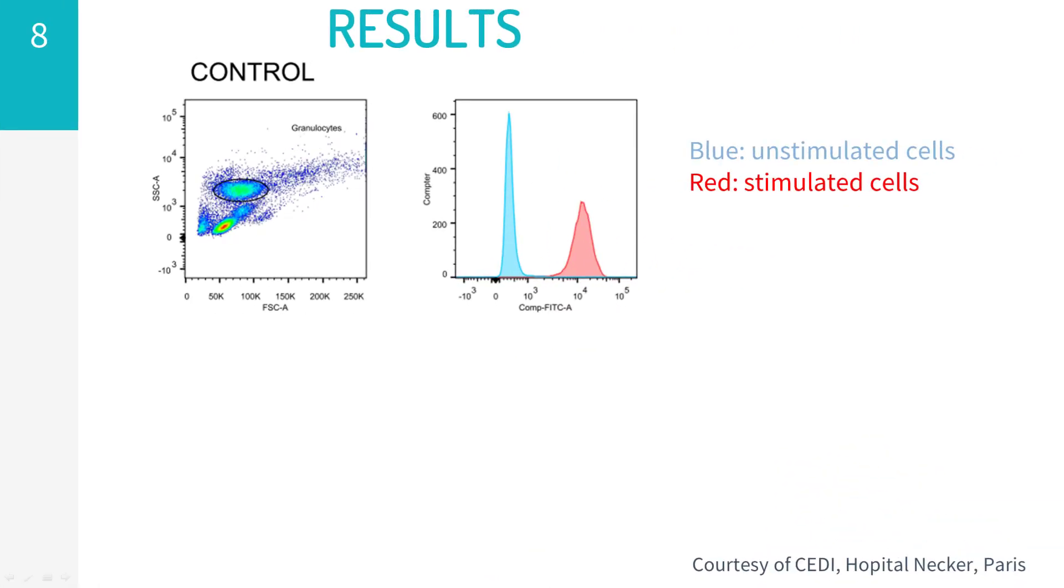Here are the results of a normal control test. You will appreciate an oval gate has been placed around the neutrophils for analysis. You can see that stimulated cells, in red, have a much higher fluorescence than unstimulated cells, which have a blue histogram and can be clearly distinguished.